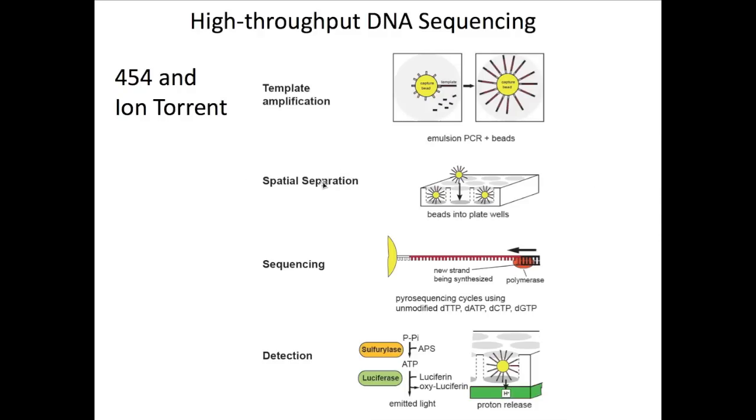And so these are basically very miniaturized reaction chambers where the sequencing by synthesis reaction is happening. And I'll describe in a little bit more detail how you can actually tell what base was added. Most of the methods that have achieved wide use so far are ones where you're not truly sequencing from a single molecule of template. Most of them involve some sort of an amplification step, which I show here.